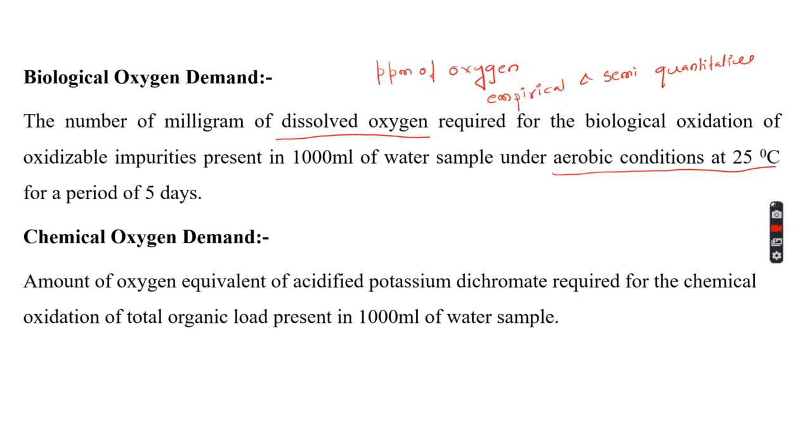It is only the amount of decomposable organic matter present in the sewage that you can detect by biological oxygen demand. And the determination mainly deals with determining the dissolved oxygen content before and after an incubation period of 5 days, so it takes a lot of time.